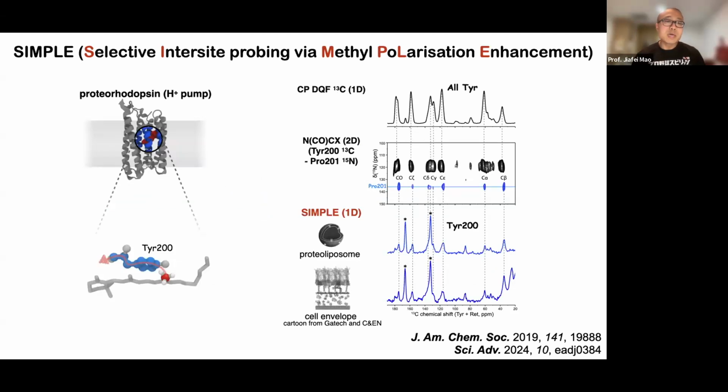As an example, you can see using this CH3 group as a selective torch to illuminate nearby residues, we can have really nice selectivity, even in a complex system. We actually applied this technique to the cell envelope, and can visualize the selective residues in a membrane protein, where all the residues in all the membrane proteins are labeled.